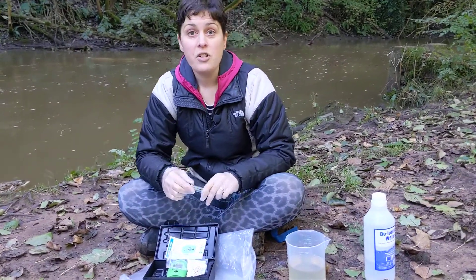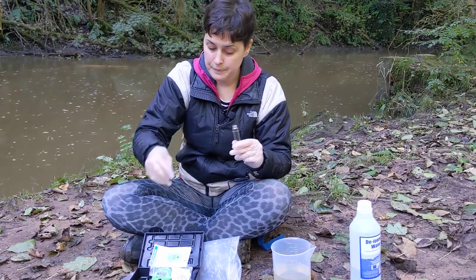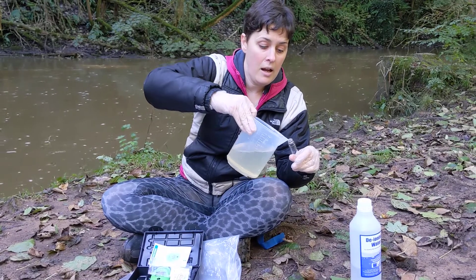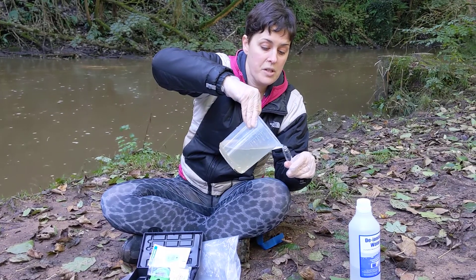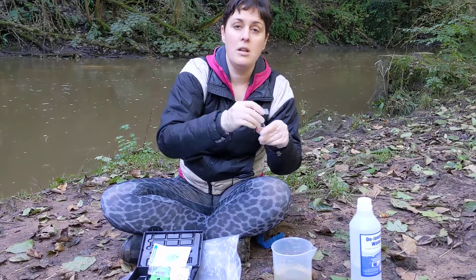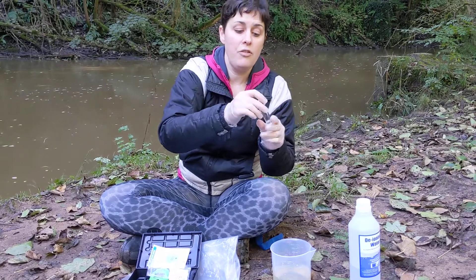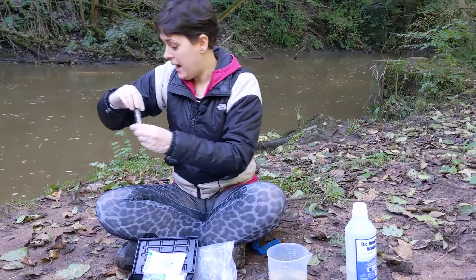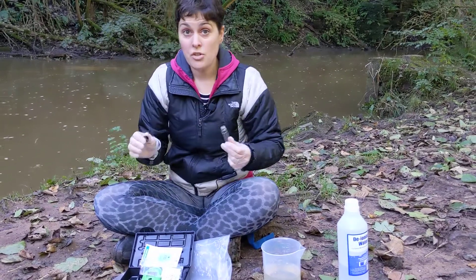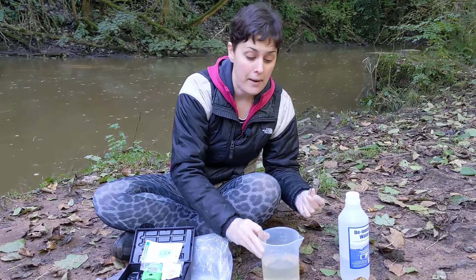To take a phosphate measurement, start with your cuvette. Take the cap off and pour in a little drop of your sample. Pop the cap back on and shake it to rinse the cuvette, then empty it out on the ground away from your sampling area. It's just river water so you can empty it on the ground. Repeat that three times.